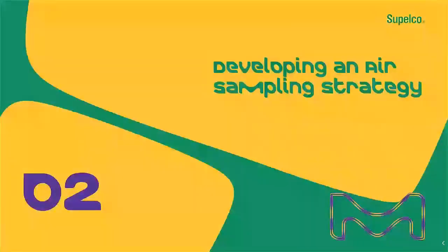have been validated. Now that you have an understanding of what the air sampling workflow looks like from sample collection through analysis, I'm going to discuss how to develop a strategy based on that information.